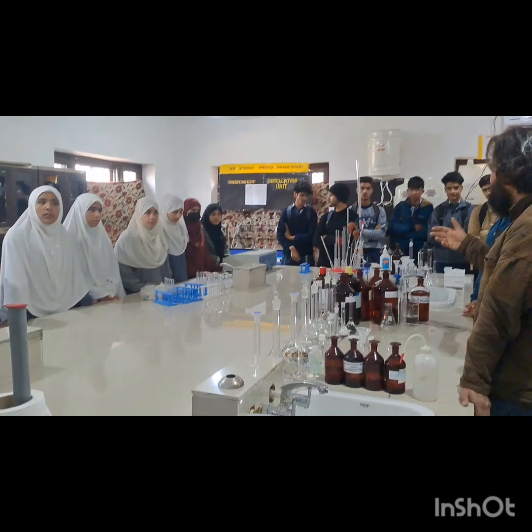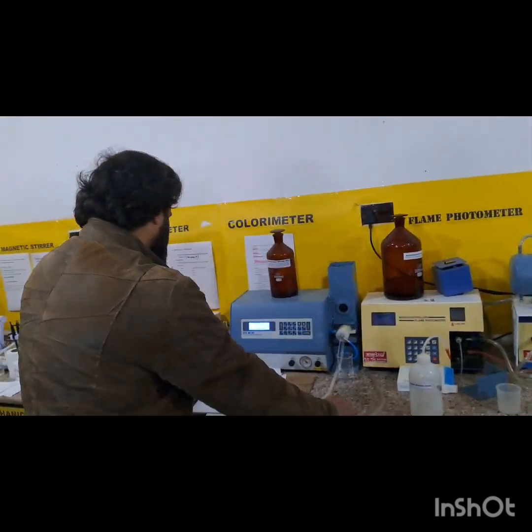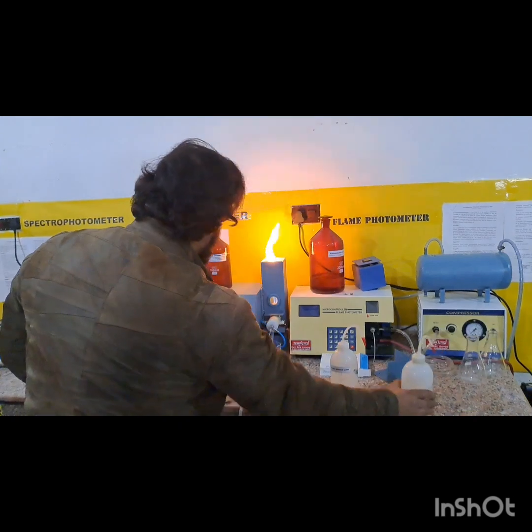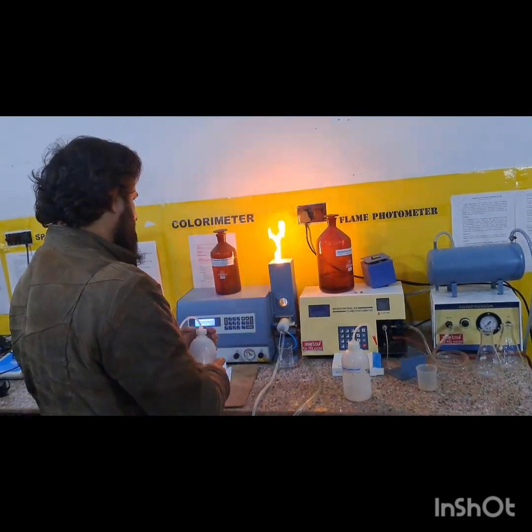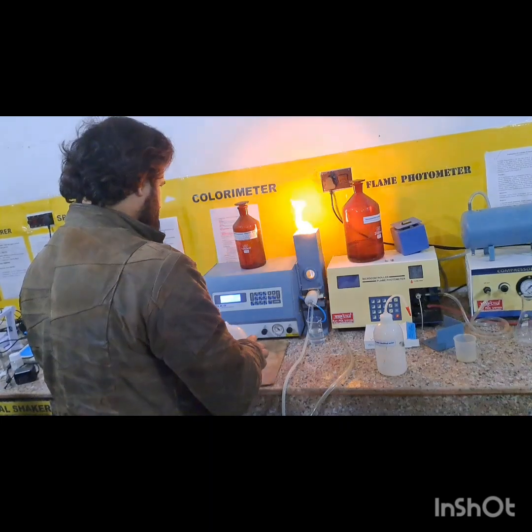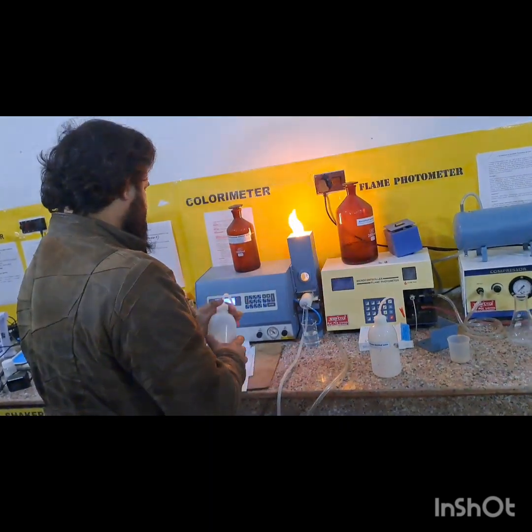3. Analysis of soil properties. Students were shown how soil pH, organic matter content, and nutrient levels are measured. Lab staff used specific instruments and explained their functions, including pH meters, spectrophotometers, and flame photometers.